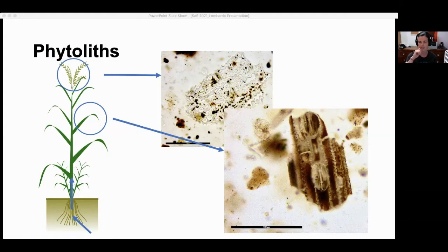As a phytolith analyst, much like a pollen analyst, you become adept at recognizing these shapes, which I'll call morphologies, and categorizing them to plant types or plant parts. Most commonly, we retrieve and examine these phytoliths from sediment samples. In theory that can be easy, but in practice it can be difficult. It just depends on the sediments you're looking at in regards to how you do this. So Tori, you can go ahead, please.